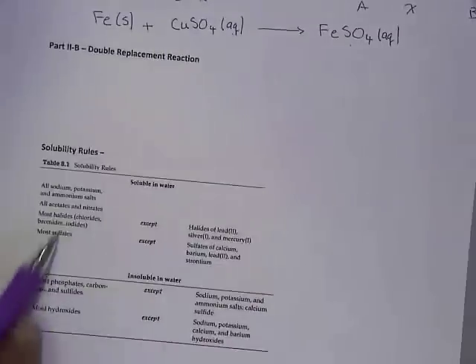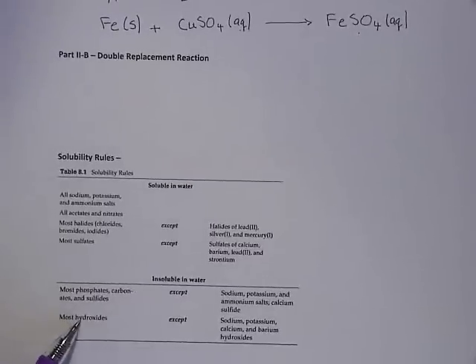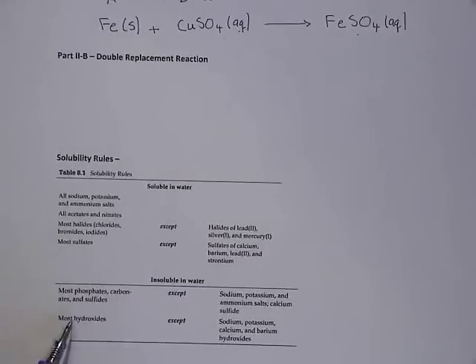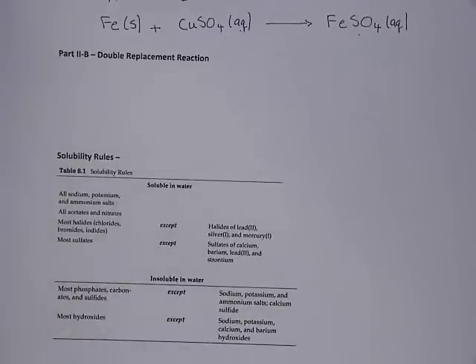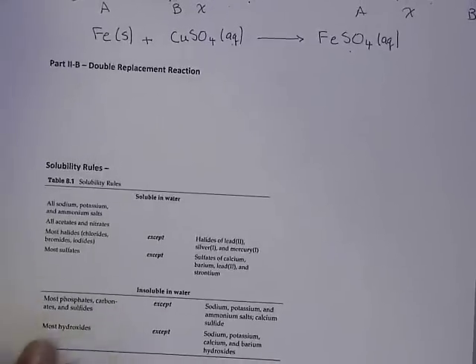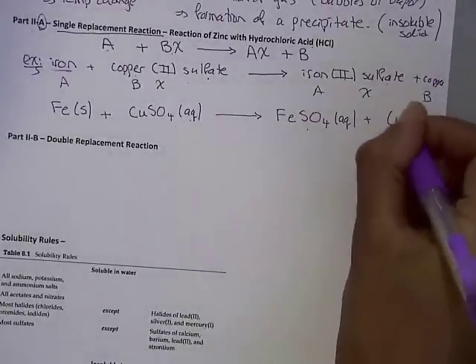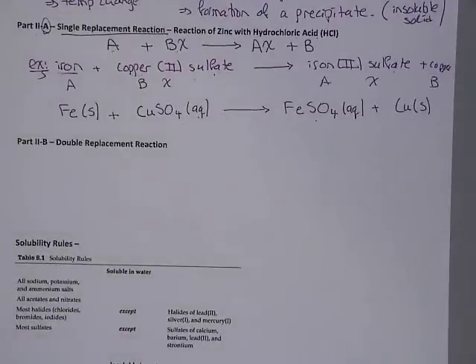I also can use my solubility rules, which you actually have to bring with you to lab for the pre-lab lecture worksheet portion instead of bringing your textbook. So your solubility rules also help you determine what's aqueous and what's not, and we'll go over this heavily in lecture. So let's just finish up our chemical reaction, and we'll see that there are solid bits and pieces in our test tube, which is copper metal.